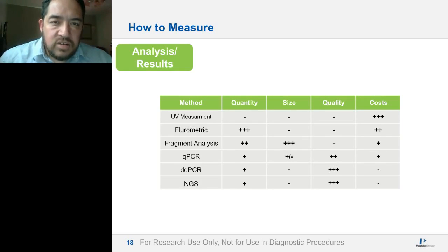So essentially, I'll be talking especially about the one method to analyze using qPCR. And as you've seen with the earlier traces, having a trace is really helpful in being able to depict the amount of circulating cell-free DNA in the fraction. And you can also look at the genomic DNA contamination in that as well.